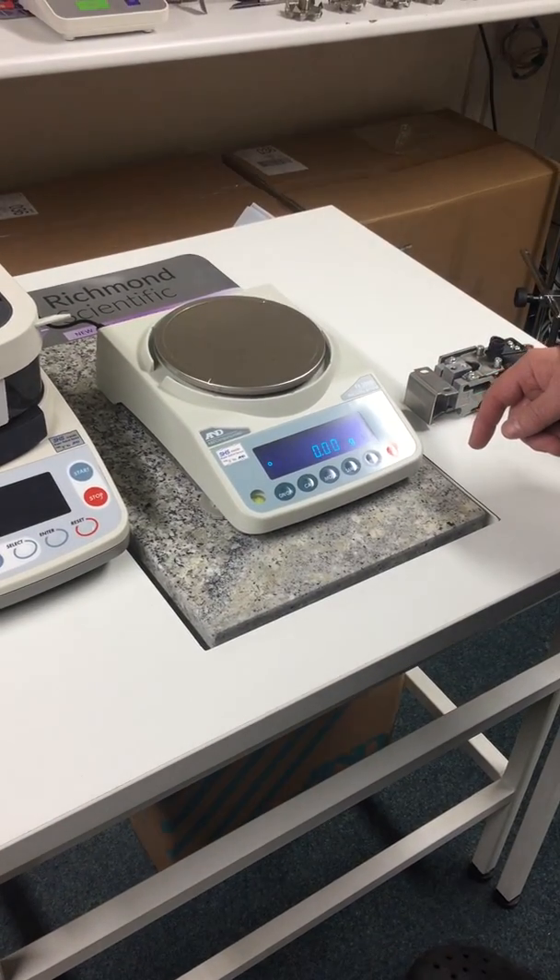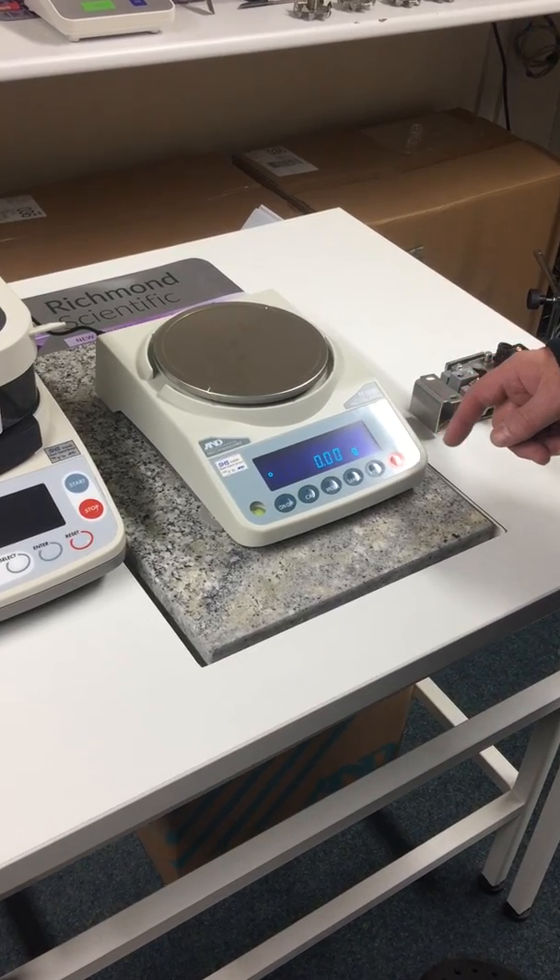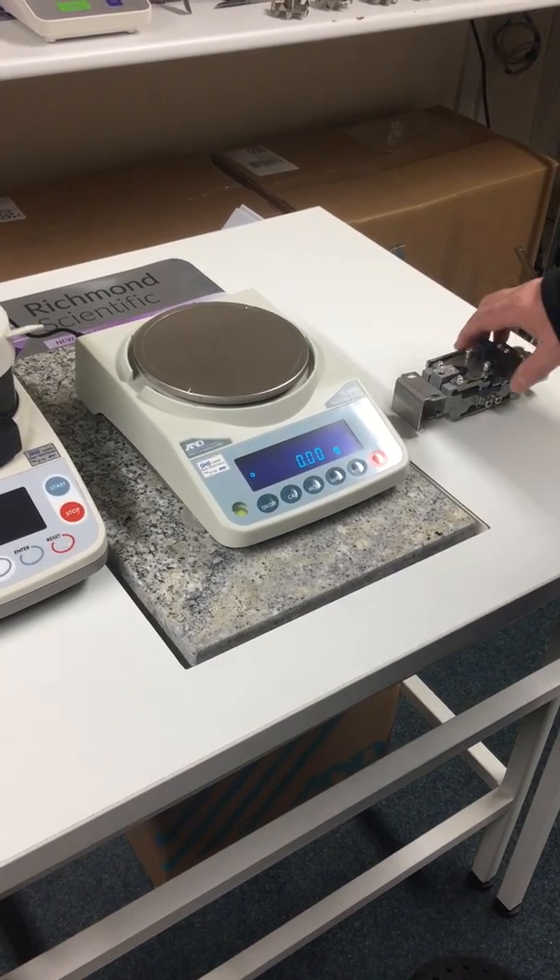This is the A&D FX3000i. This is a top pan balance, 3200 grams to two decimal places.